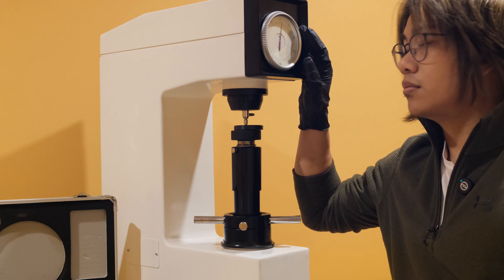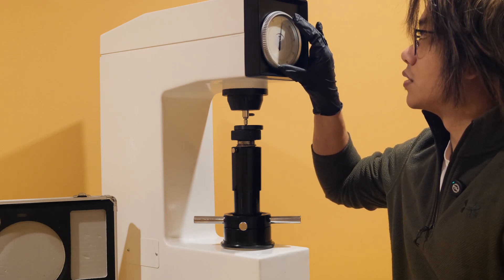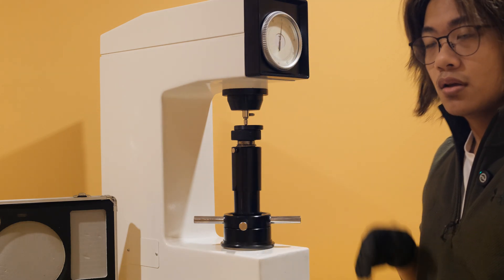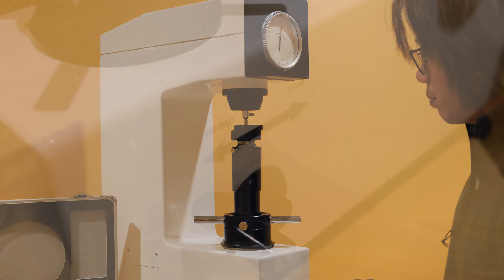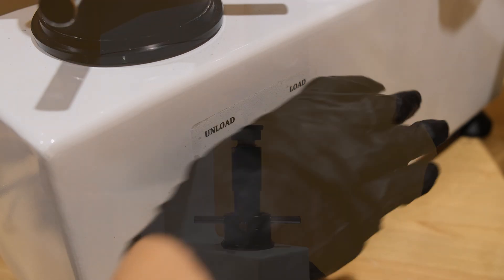Adjust the outer ring as needed to spin the indicator. The zero mark should match the position of the needle.